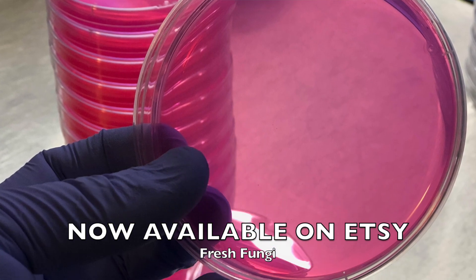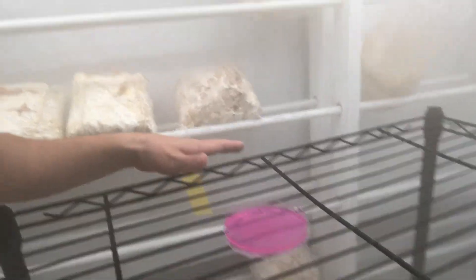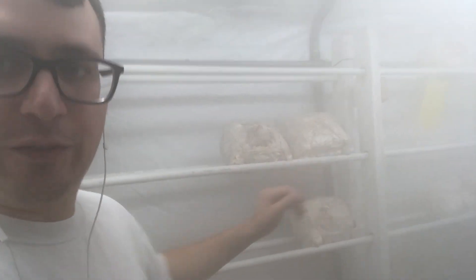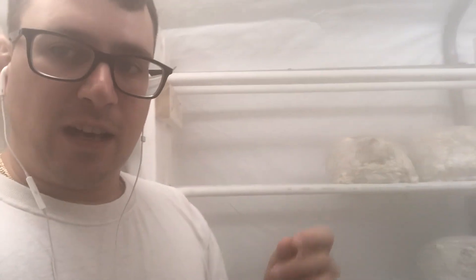I've got my settle plate and I have not opened it yet. I'm going to set this on this cart here and set my timer for 20 minutes — that's going to be the initial reading before I clean my tent. You can see I've got a bunch of already fruited blocks; some of them have had their third flush already. I'm getting ready to clear this whole room out, and I want to take a record of the spore load right as these bags are about to leave, then do another one after I clean the room to know the spore load as I'm putting in my new bags.